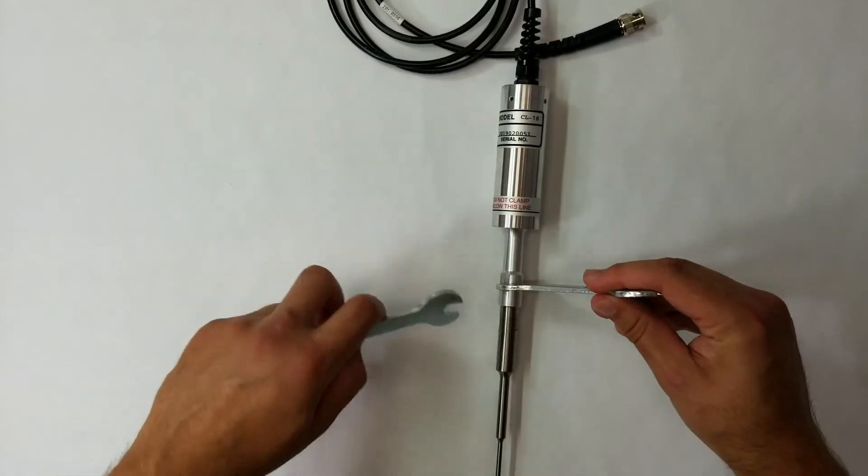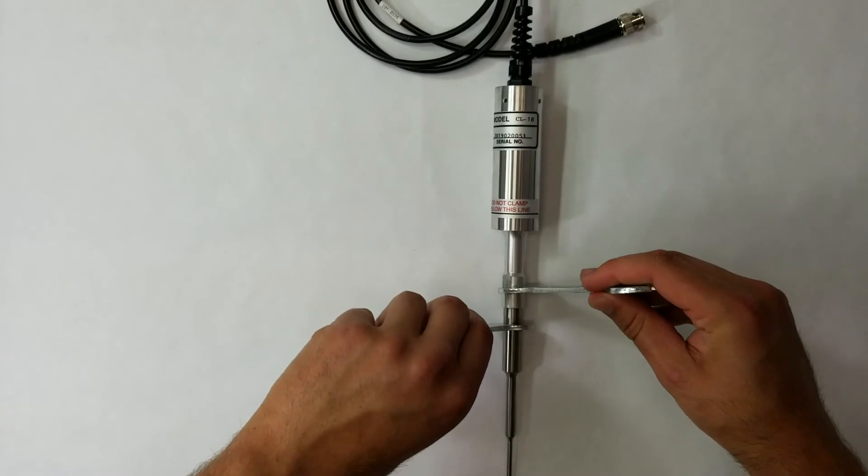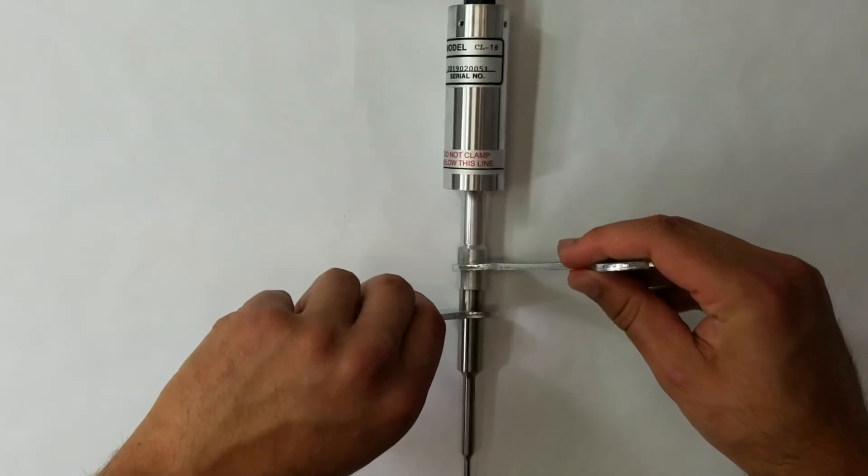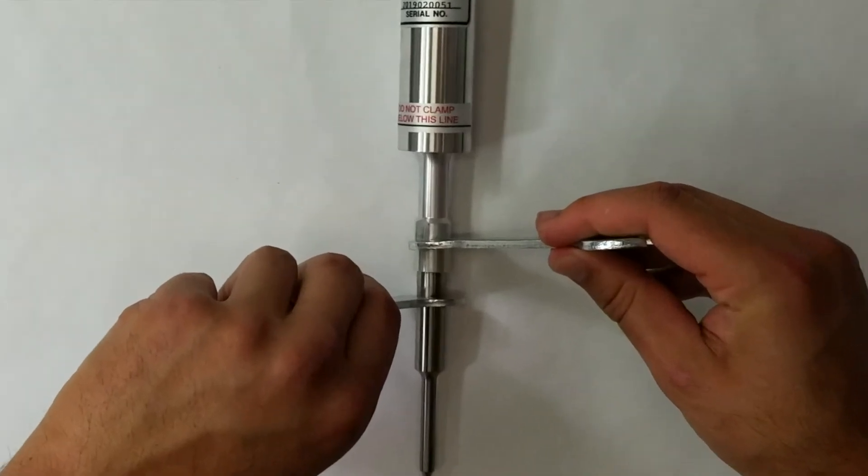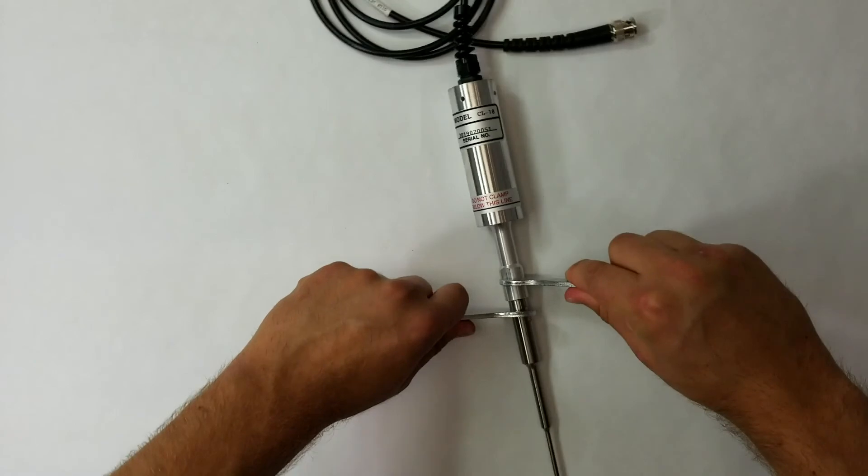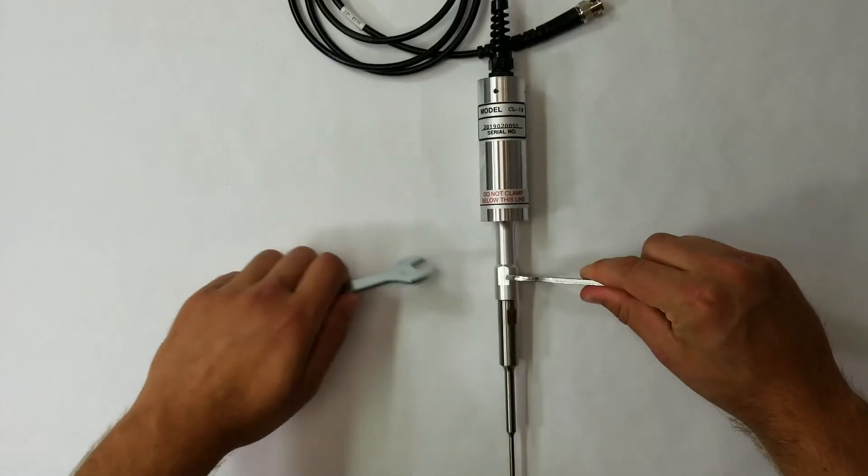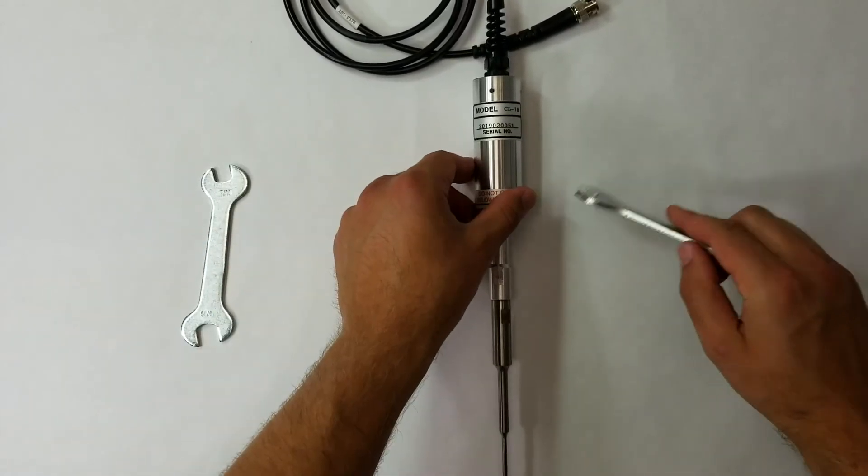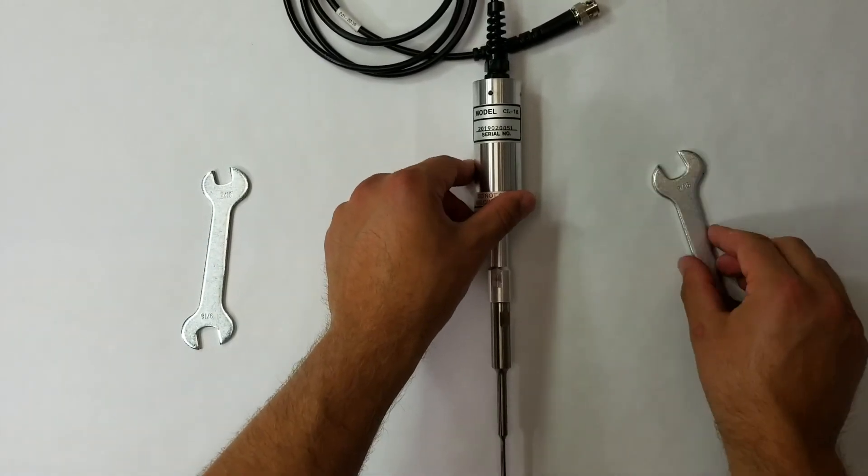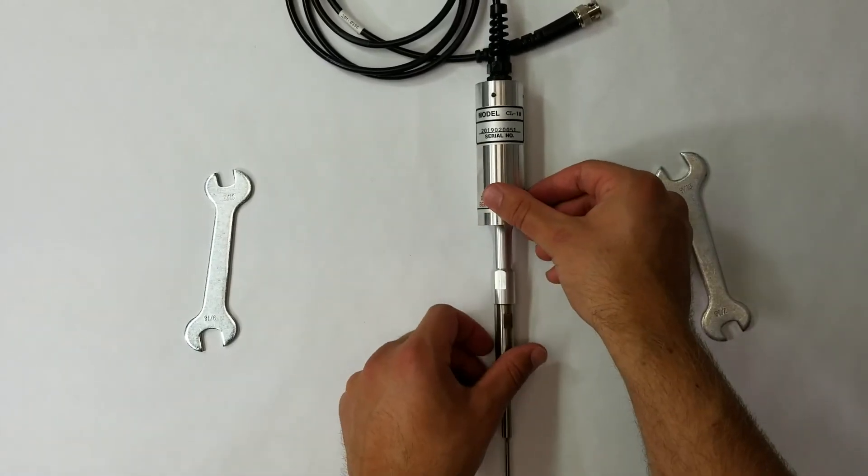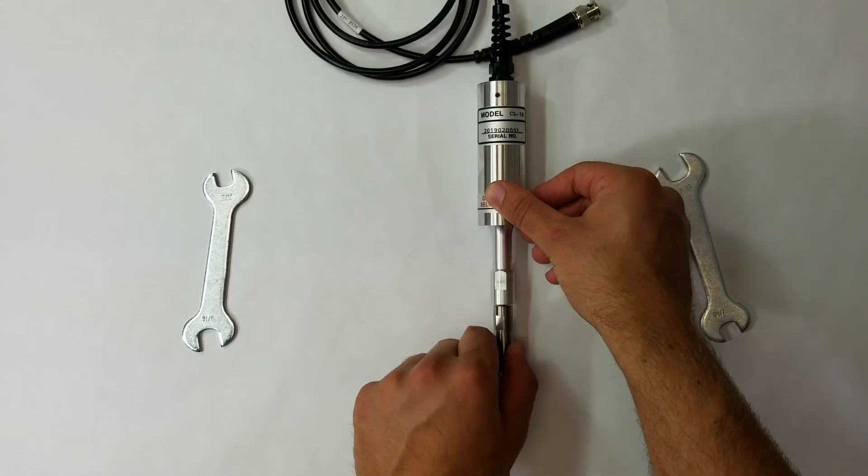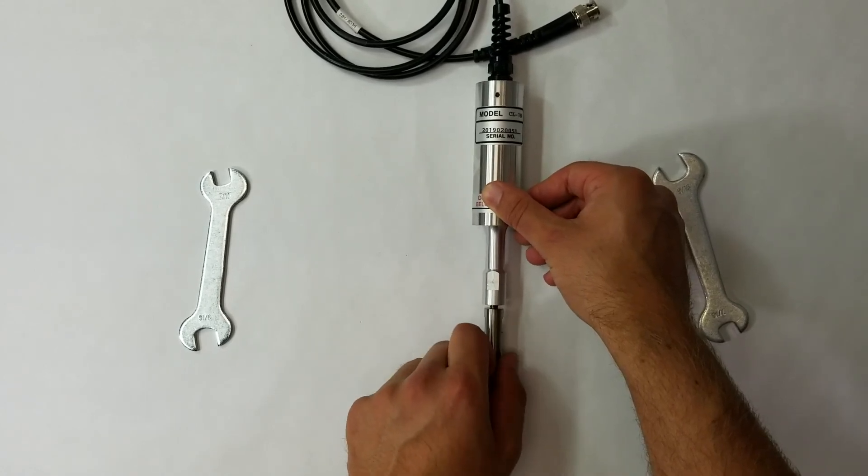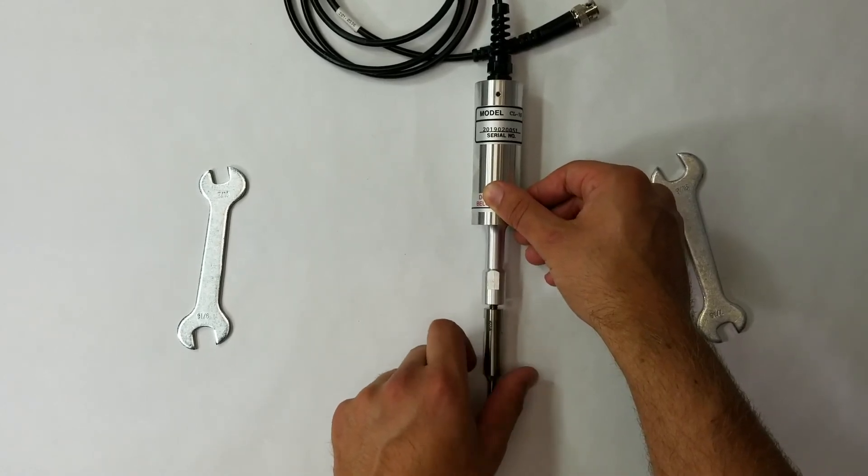Next, place the 7-sixteenths end of the second wrench on the wrench flats of the probe. Push down on the wrench handles until the probe moves easily. Remove the wrenches and unscrew the probe the rest of the way by hand.